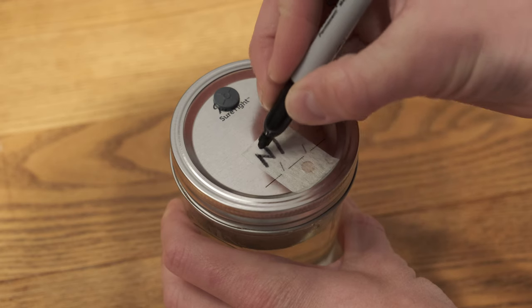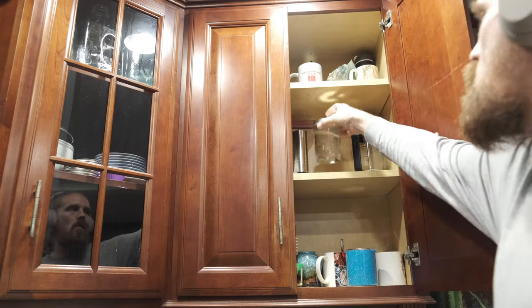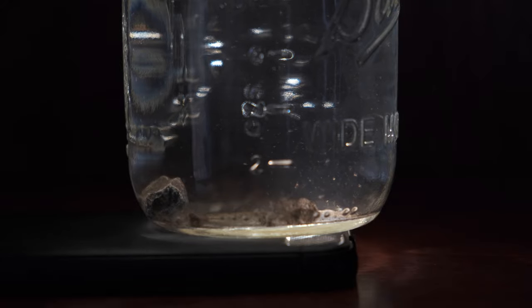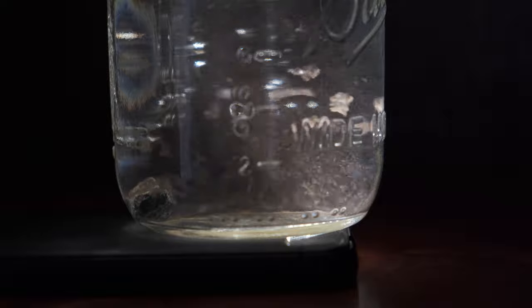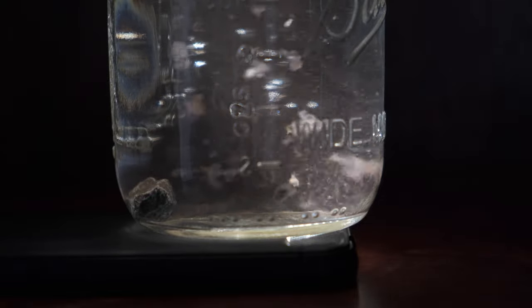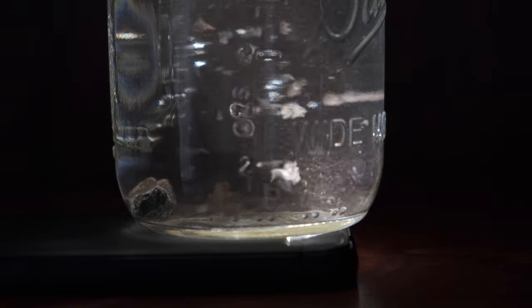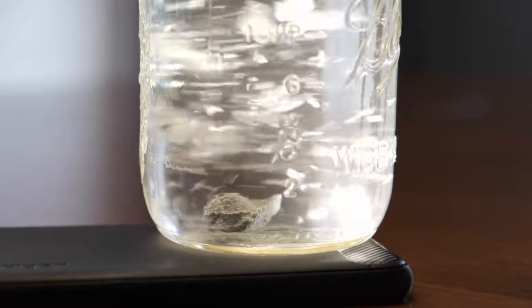Then I set the jar aside somewhere that's going to stay mostly dark. You don't have to check on it for about a week, but I put it up with my coffee mug so I get to look at it every day. After about a week you'll start to see mycelium forming — here we can see a lot of spores still swirling around but also these white chunks of mycelium. After about three weeks we'll see that the spores are all gone and there's a ton of mycelium floating around in there.